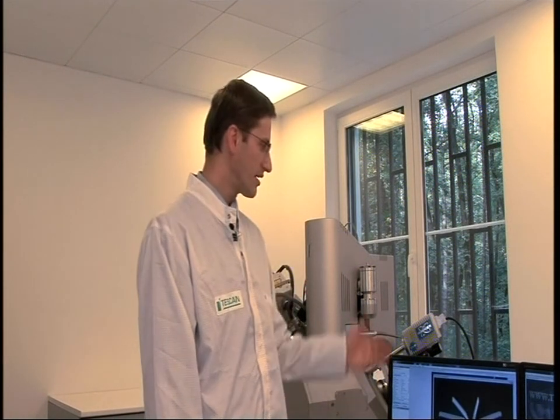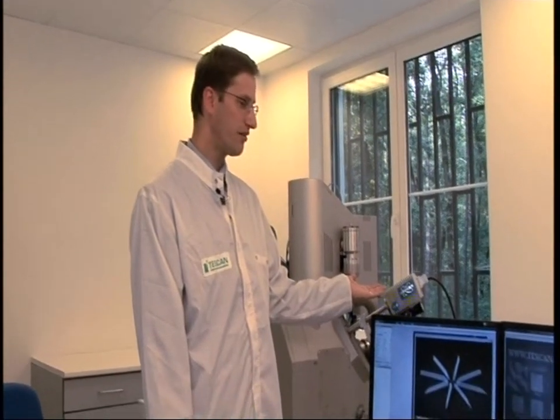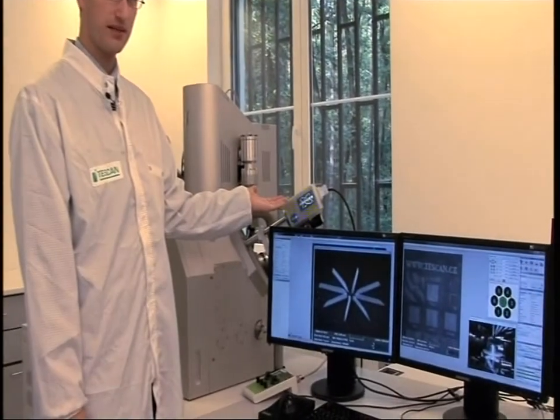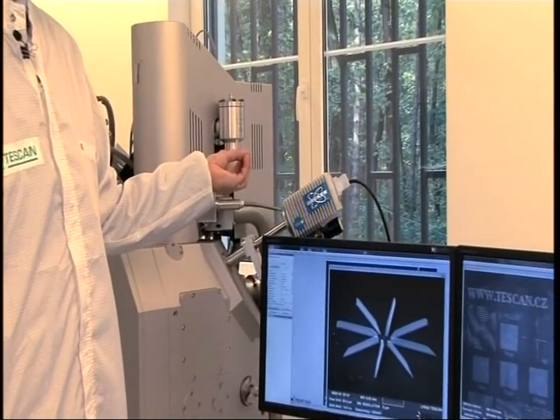Now we can prepare and view our samples. Besides that, we can also use the Fiblis apparatus to analyze them. Here we have the energy dispersive X-ray spectrometer, which allows us to identify the chemical composition of our sample.